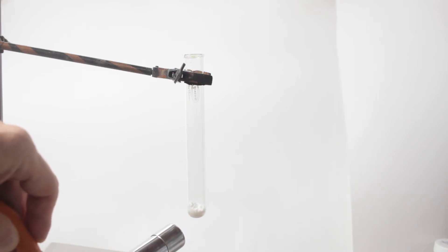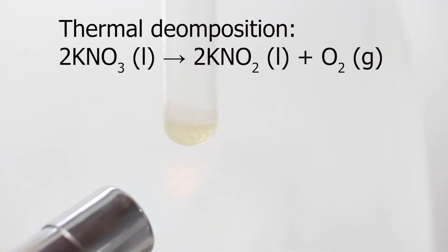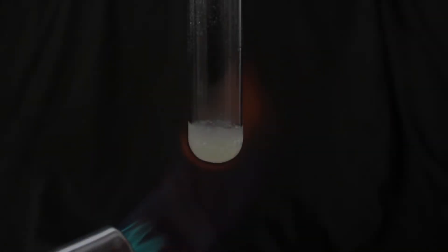It decomposes differently than most nitrates. No brown nitrogen dioxide, just potassium nitrite and oxygen gas. These bubbles which you can see here are the result of decomposition of the salt, made up of oxygen gas.